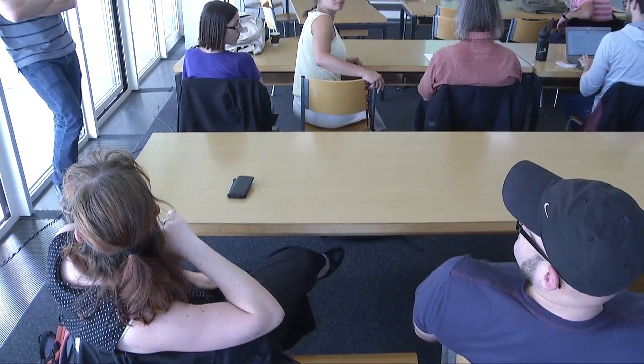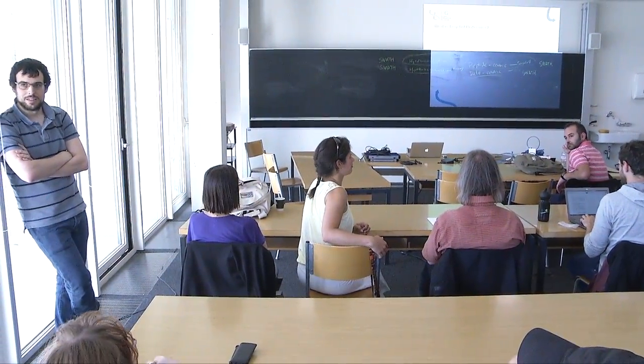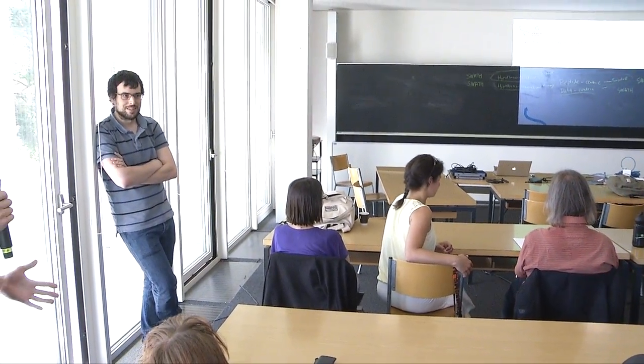Maybe I can point something out about it. There's some confusion about this swath name. It wasn't actually Sciex that came up with this name. It came from us. It was actually Ludovic Gillet's wife, because Ludovic gave the talk on MProphet. His wife is some kind of a geophysicist, and they do this swath satellite acquisition. So it actually came from there, and AB decided to go ahead and register a trademark, and this has caused some confusion. But when we refer to swath, it's as described in this 2012 paper from Ludovic, and you can do with that what you like.